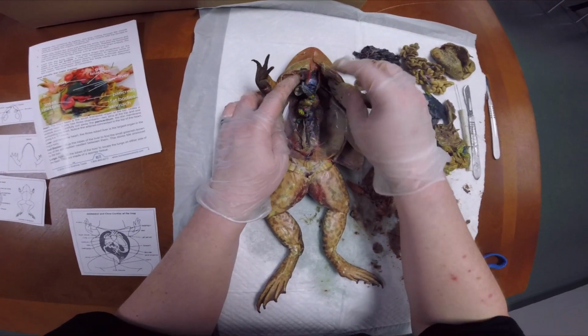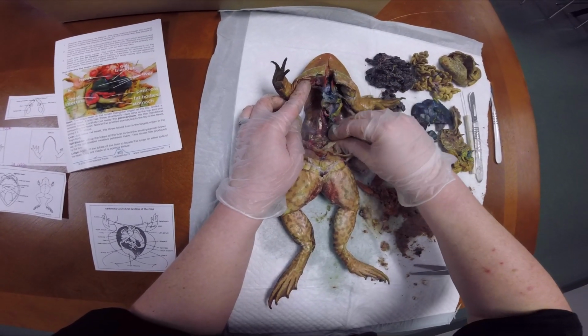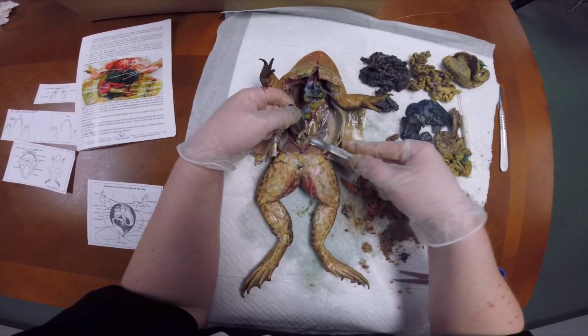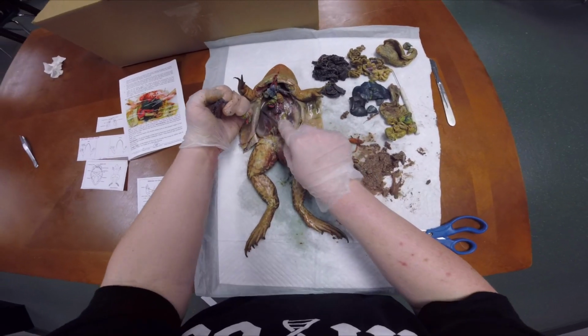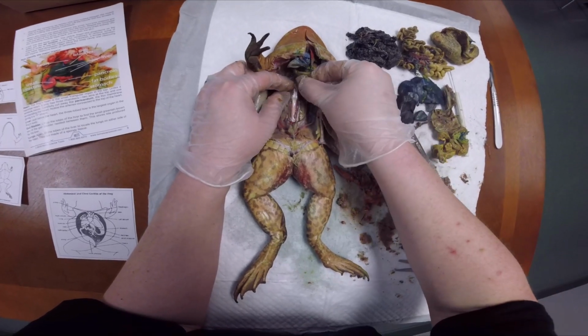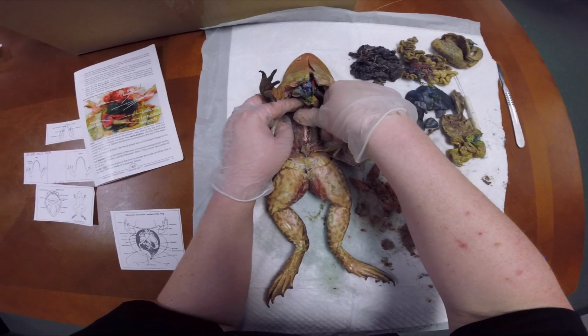I want to find the heart. Okay, let me cut this out so we can see the backbone, because frogs have a backbone. Okay, so there is the backbone right there. Nice and strong. Very good.